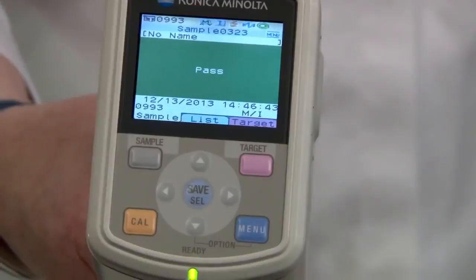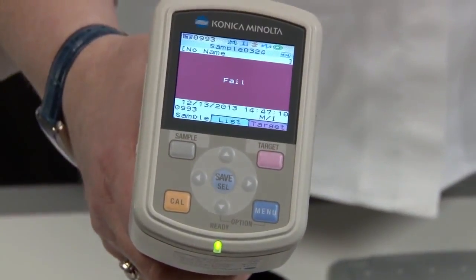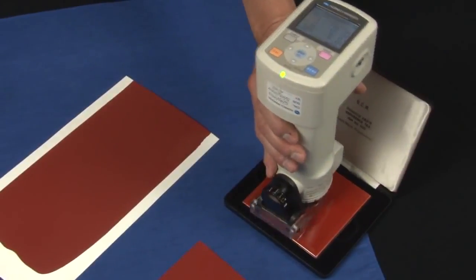Pass-fail assessments immediately indicate if a sample meets color standards and can compare a sample to a standard.